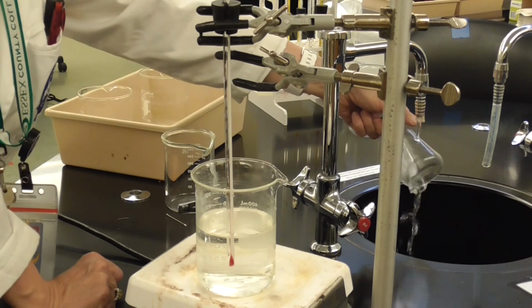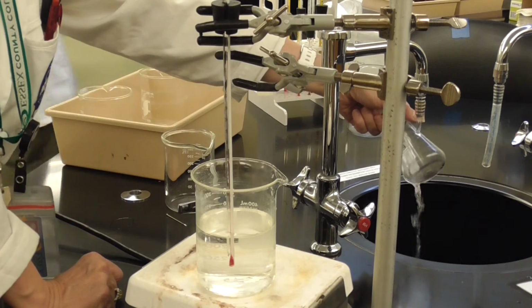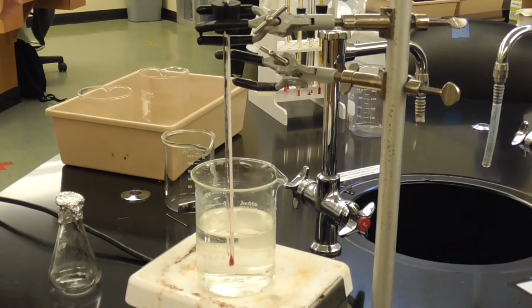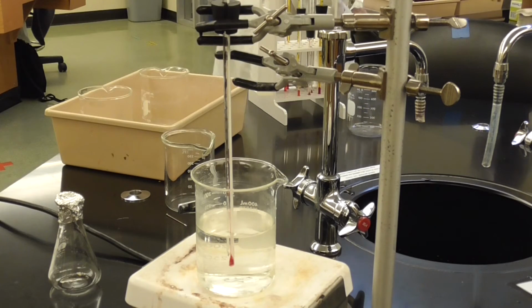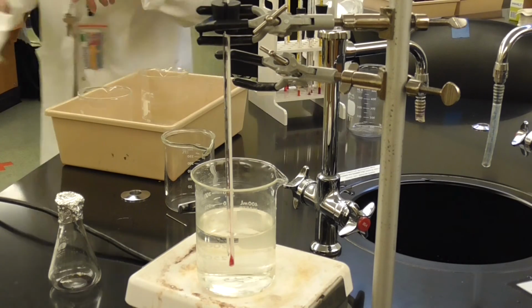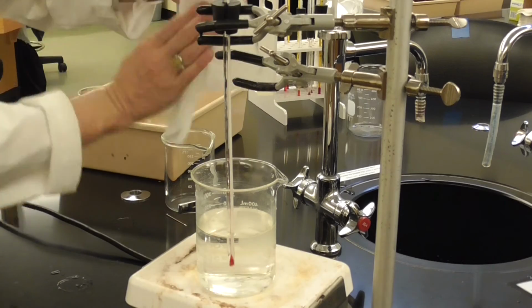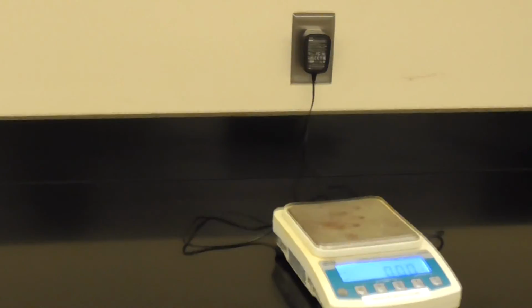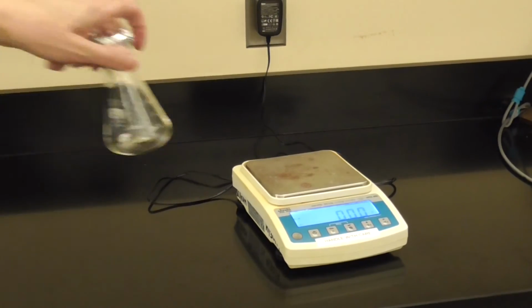We take the flask, remove it from the water, clean it, and then dry it. Then we're going to take it back and weigh it over here with our balance.